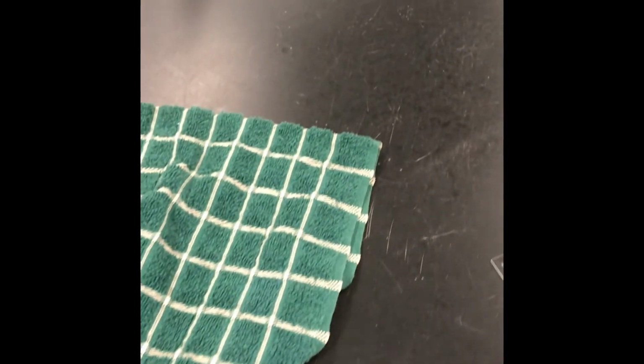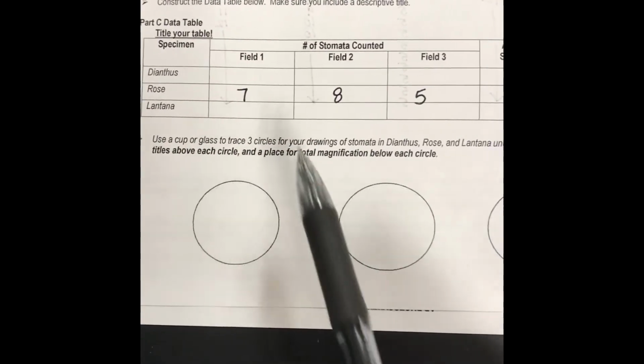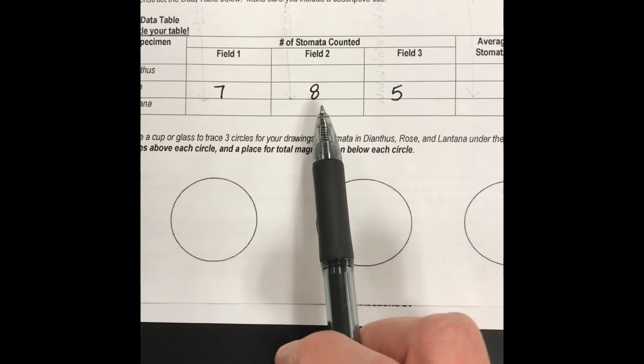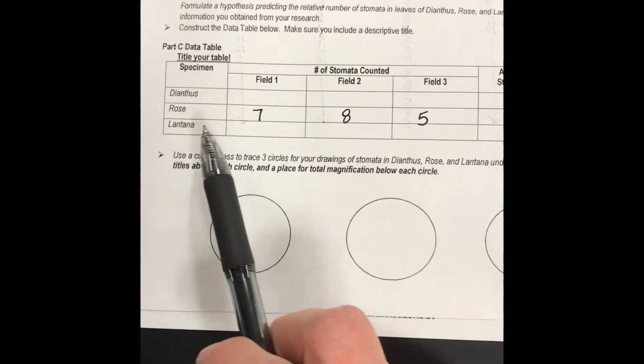There you go. Okay, so push pause, count, and make your drawings. That's Rose. Okay, so I just finished the rose. I counted 3 fields of view. So the first time I counted, I did the 7, and then I moved it over, kind of right, left, up, or down. I counted 8, and then I counted 5. So that was the rose.